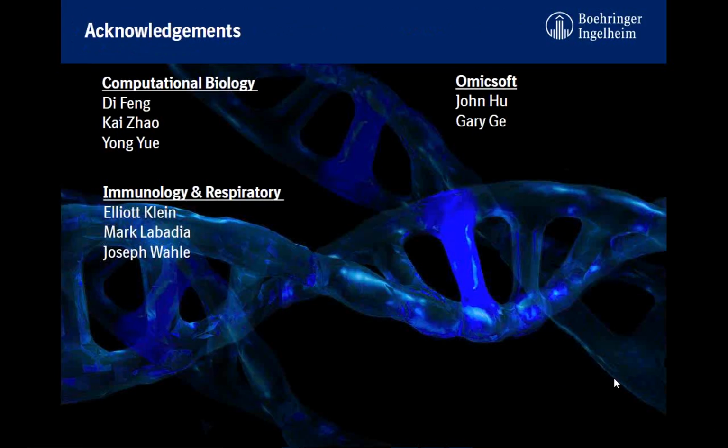So in single cell, we're still deconvoluting information. It doesn't mean we can truly know what every gene really does. But it's much better than previously, almost similar to why you want to do WGCNA analysis. Why do you have to spend so much time collecting hundreds of samples in the bulk? So I think it depends on purpose.